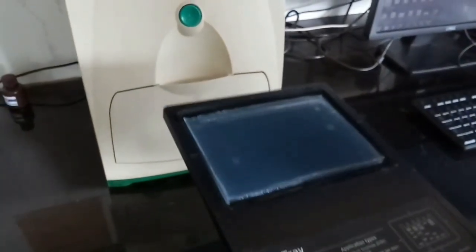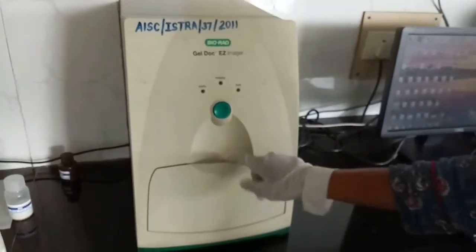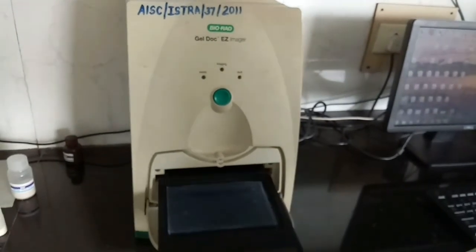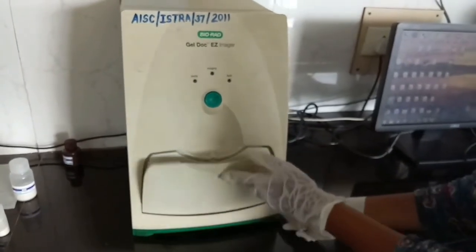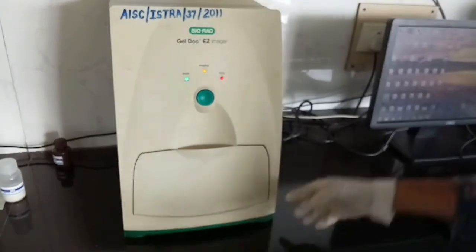Now we will place this UV tray into the imager. So first we start with opening the lid, then we will place the tray inside. We will close the lid. We will switch on the main supply.